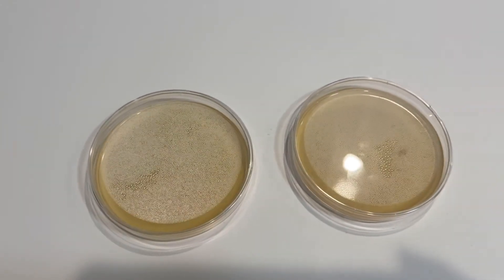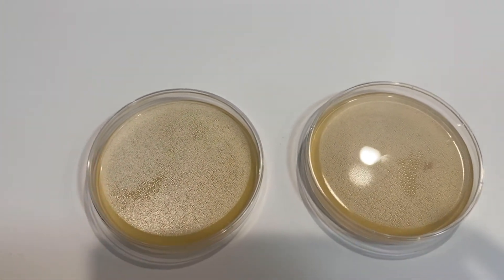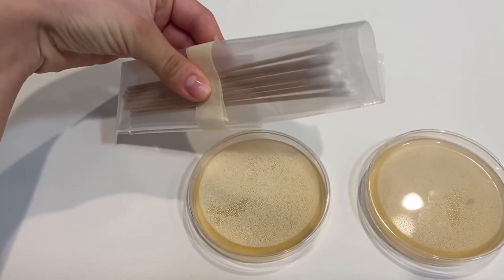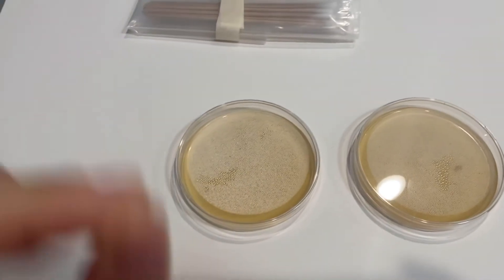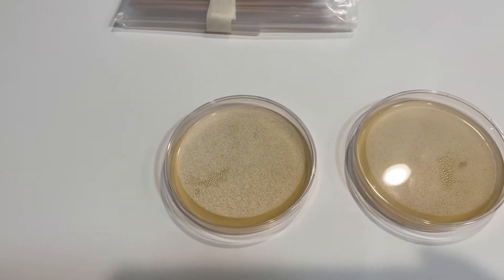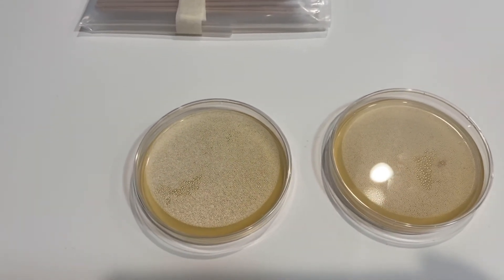Now I have to do the surface sampling. For this I need the cotton swabs, with which I will collect the microbes from different parts. As my partner will do the sink, I will do the computer keyboard.